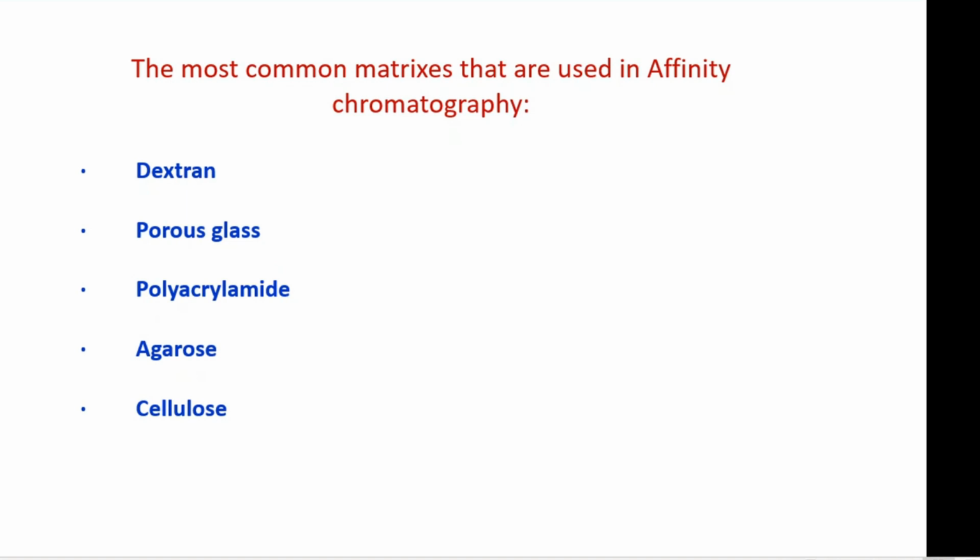But you see, the polyacrylamide has the capacity to make a porosity containing gel, so that's why it can be packed inside a column. It may be a syringe, or a burette, or anything else which we can call a column. In that column, we are going to pack it.